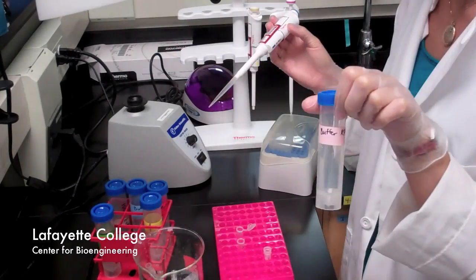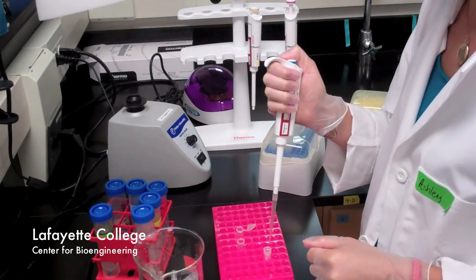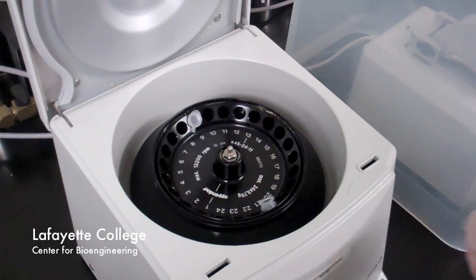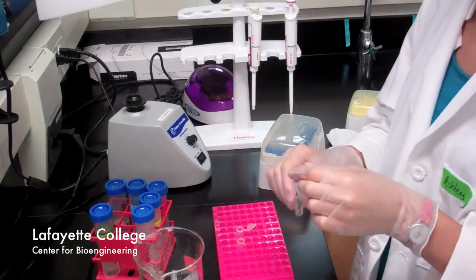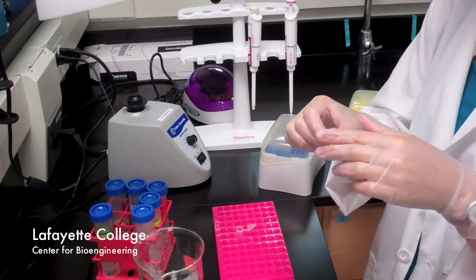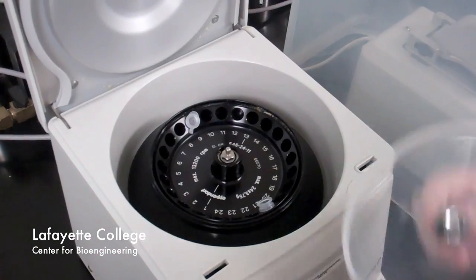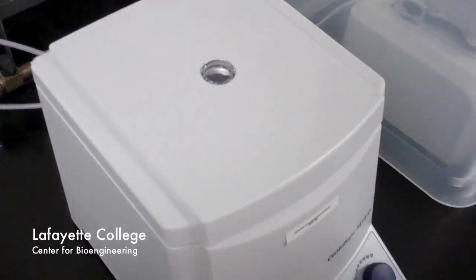Add an additional 500 microliters of buffer RPE to the column. This time, centrifuge for 2 minutes at 10,000 RPM. Instead of discarding the flow-through, discard the entire collection tube and place the spin column into a clean 2 milliliter collection tube. Centrifuge the column for 1 minute at full speed.